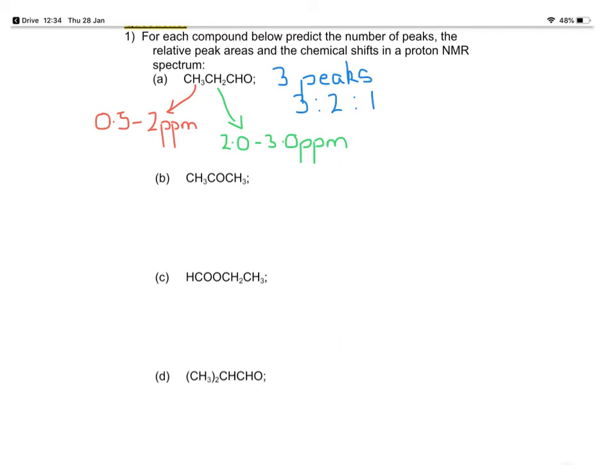Now if I look at the one at the end then, this one hydrogen here. Now this one hydrogen is attached then to this carbonyl group, and that's like we would find in an aldehyde. So on our data sheet then, our chemical shift will be between 9 and 10.0 parts per million. Now I'm going to work through each compound in turn, but it might be a good idea if you pause the video, work through it yourself, and then just check that you agree with me.